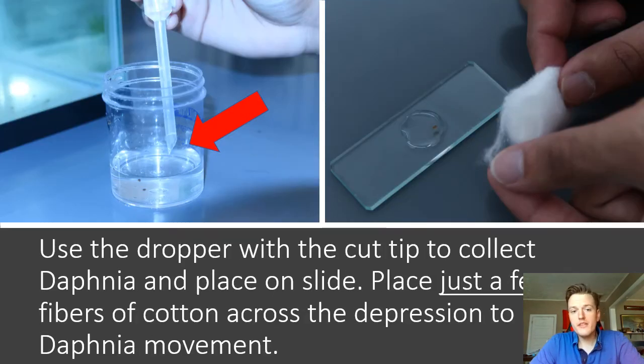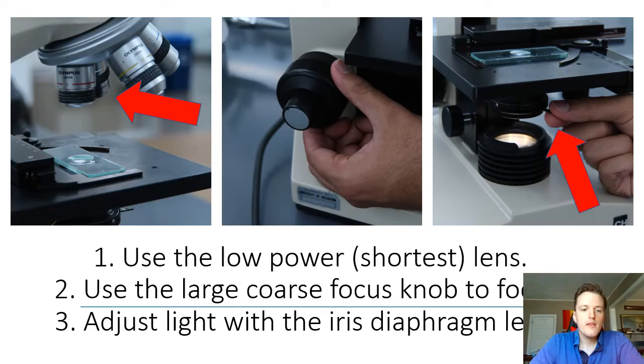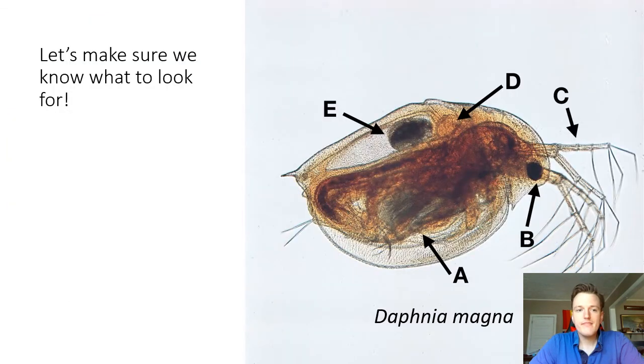We obviously don't want the Daphnia swimming around when we're trying to watch them, so this is just the method of keeping them in place. You guys will be watching a recording of the Daphnia in the microscope. It was on low power and it took a while to focus, and so that's how it was done. When you're looking at the Daphnia, you'll be watching a recording and collecting your own data on the change in heart rate.